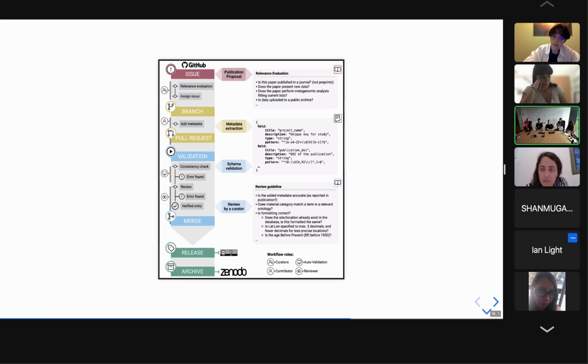And that's another good example of the QIAGEN thing, why the project is here. People were submitting kits, and the kits are not listed with what they're doing, so you don't actually know what's happening to the DNA. You don't know, is the damage being removed? Is it doing some weird thing and adding additional, non-standard adapters? By curating this information, that's how we can clean this up and make sure it's easy for everyone else to reuse your data.